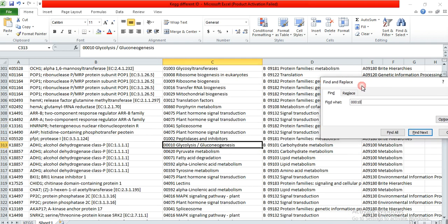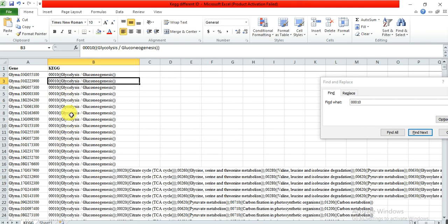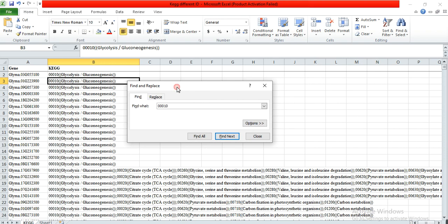That ID and the name of that pathway is present in column C. Here you can see that there is the ID and then there is one space and then the name of that pathway. So we also need to make our IDs according to this one, because in our ID file there is a name or number and then there are parentheses or brackets — so we delete these parentheses or brackets.